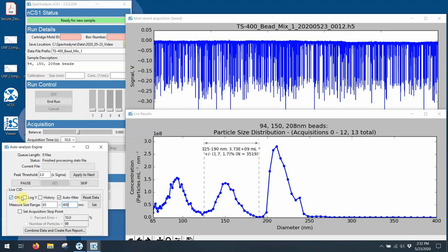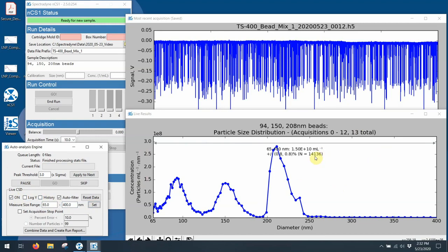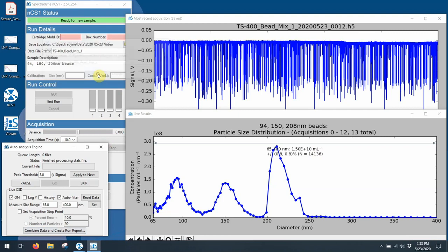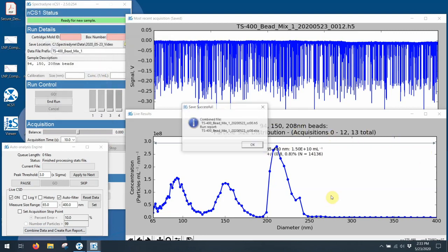So in other words, during that 130 seconds of acquisition, we acquired 14,136 points. And the overall concentration was 1.5 times 10 to the 10th particles per ml. When I'm done with a run like this, you can see that it says I'm ready for the new sample up here. And then the other thing I'm going to do is I'm going to combine this data and create a run report. And so that takes these 13 files and then combines them into a single one.